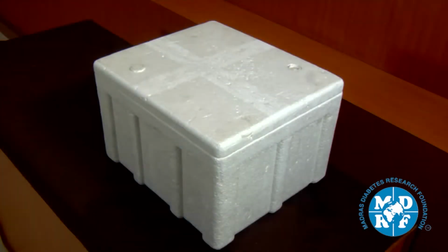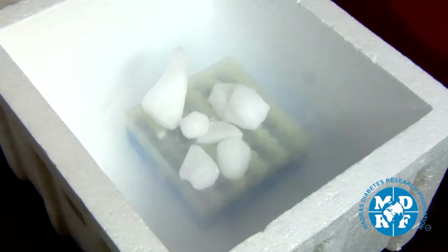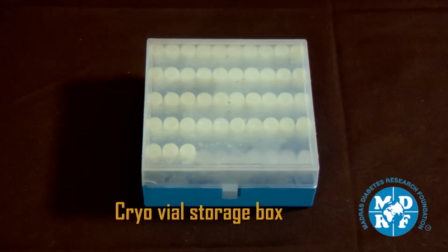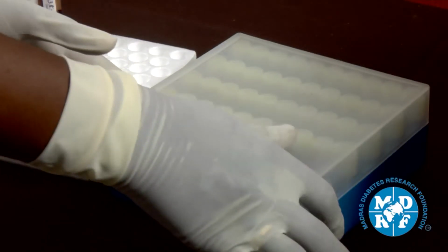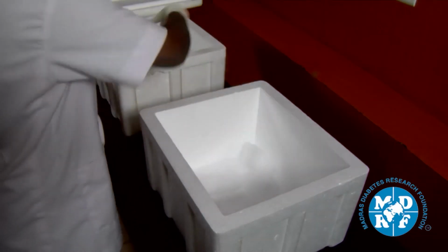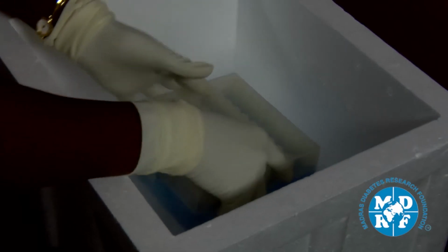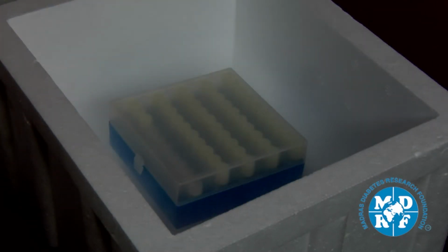The items required for storage of samples are ice box, ice packs or gel packs, or dry ice, and cryovial storage box. Arrange all the aliquots in the cryovial storage box. Now place the dry ice in the bottom of the ice box. Carefully place the vial box inside the ice box on top of the dry ice.